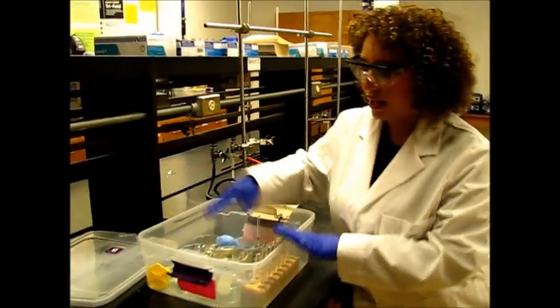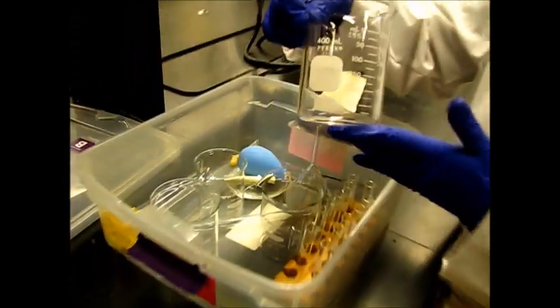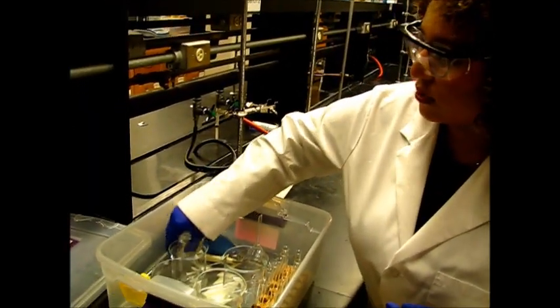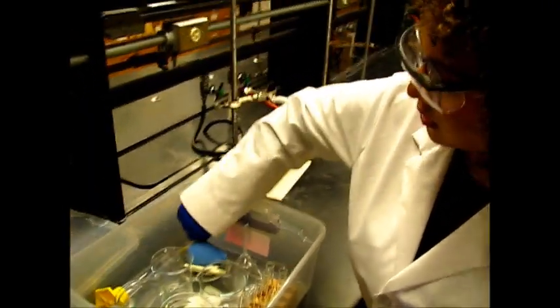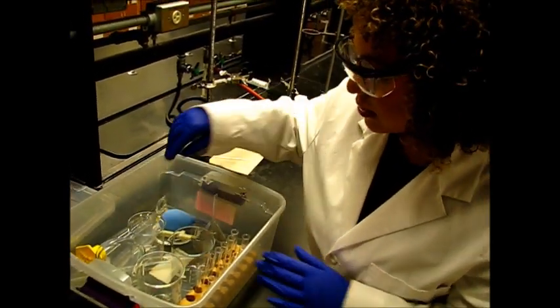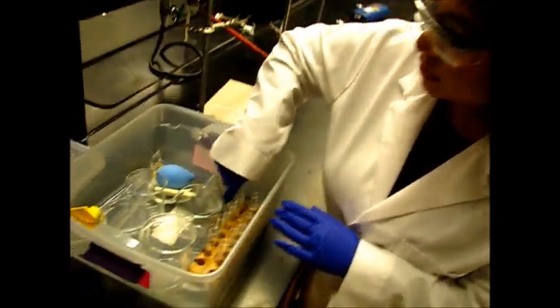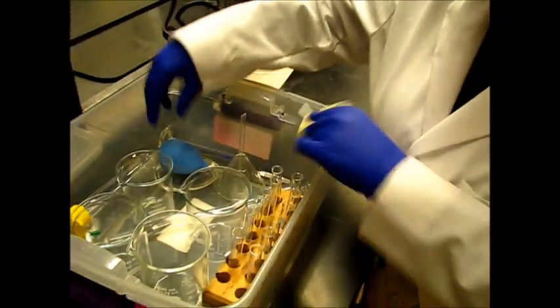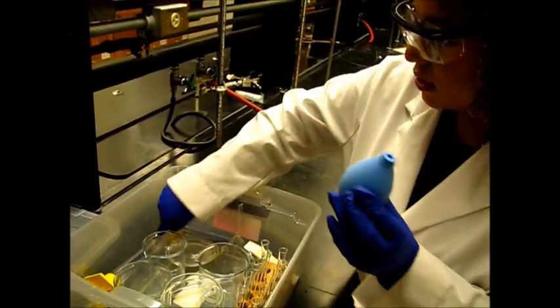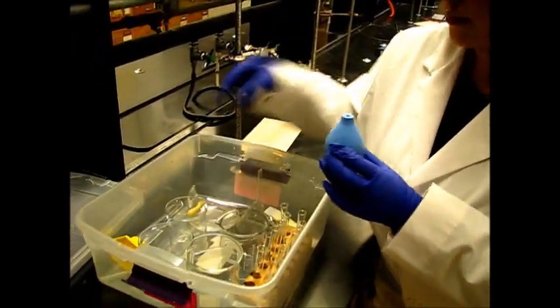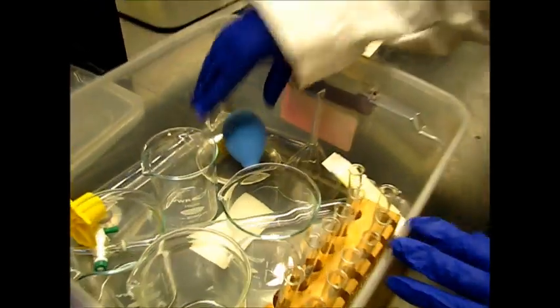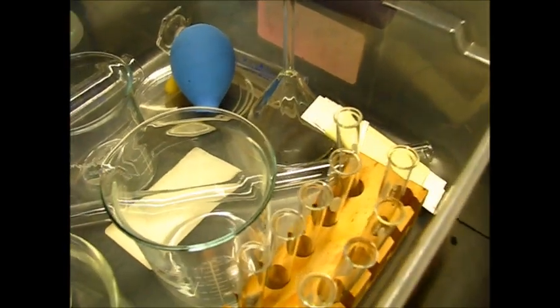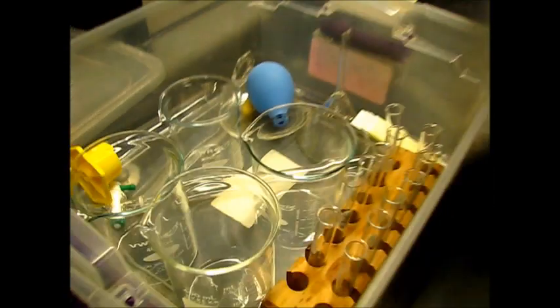In our bins we will have three 400 mL beakers, one 250 mL beaker, we will have one 50 mL graduated cylinder and a 10 mL graduated cylinder. We will get 12 test tubes, our glass column, three watch glasses, TLC plates, and then we have a blue rubber bulb and an amber bulb. There is one spatula and the glass funnel.